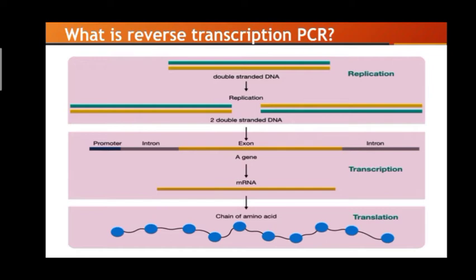So during transcription, only the coding sequence exons of a gene form a transcript, which is the mRNA. Therefore, by quantifying the RNA, the amount of a gene present in a cell can be measured or determined. This is the whole fundamental of gene expression studies.